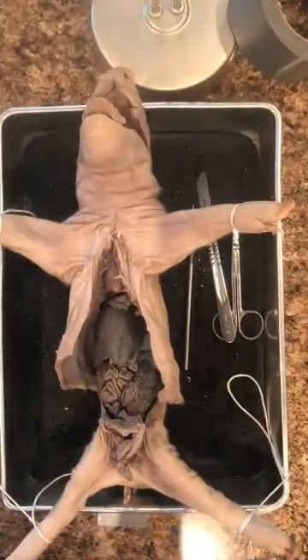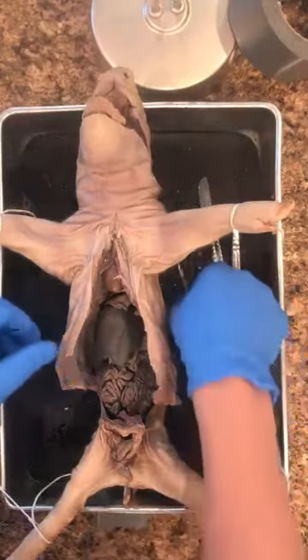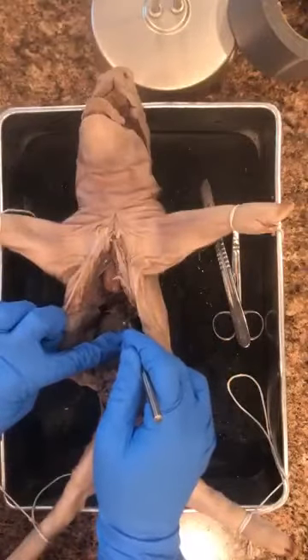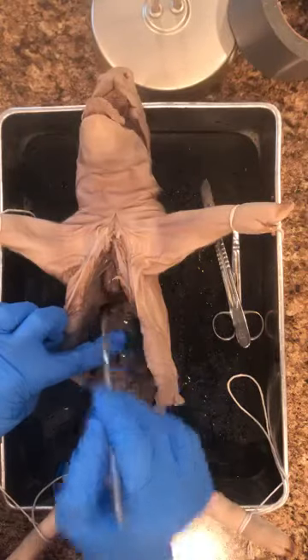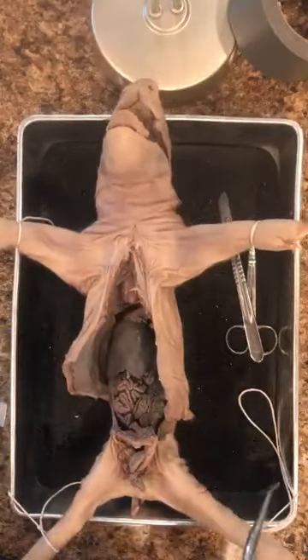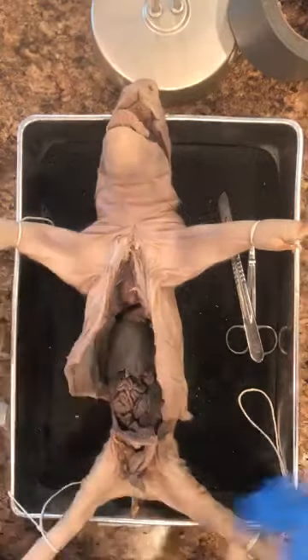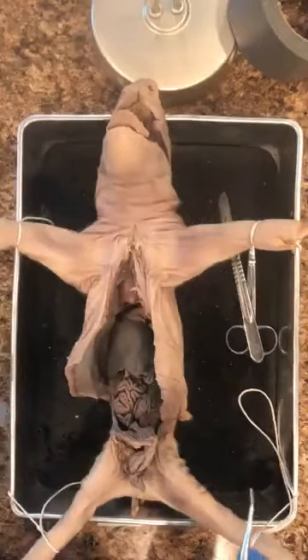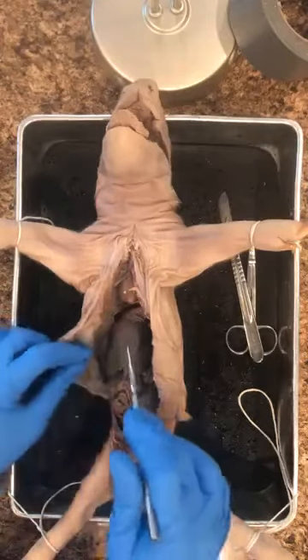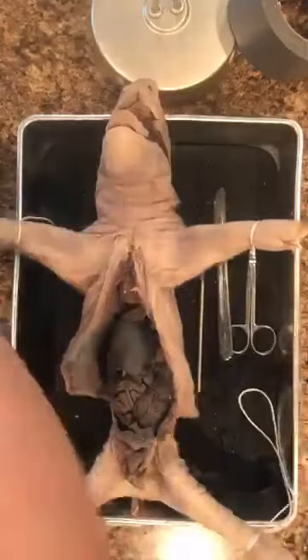Okay, I already cut through the rib cage, and you can see the lungs and the heart. So once again, here's the diaphragm, the lungs are up here, and then here's the heart right here, nice and pretty. Hopefully you can see all that. Okay, we are going to take a look at the digestive system at this part. One of the largest structures right below this diaphragm is going to be the liver, which was really big in the frog as well. I'm going to pin these open.